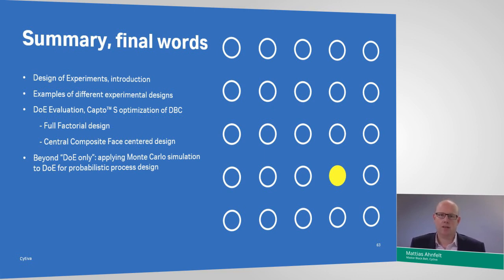So when we evaluated that central composite face-centered data, and looked firstly again at the residuals, we saw that the curvature had disappeared from the residuals. There were no longer any systematic trends in the prediction error in the residuals. We saw that the residuals also very nicely followed a normal distribution. So meaning that whatever we couldn't explain in the f of x part was more or less random noise, random variability on how binding capacity changes when you run repeated runs on the process.